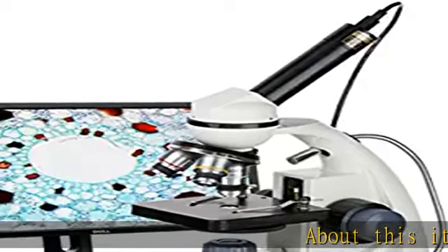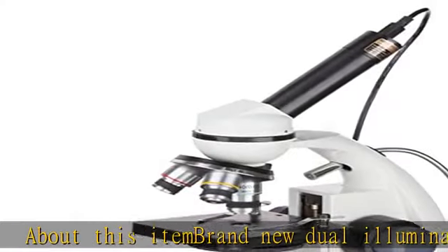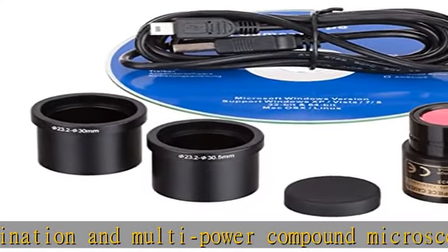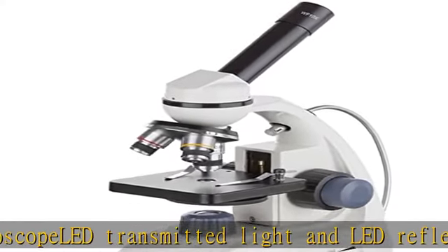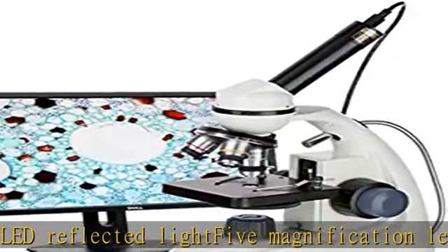About this item: brand new dual illumination and multi-power compound microscope. LED transmitted light and LED reflected light. 5 magnification levels — 40x, 100x, 250x, 400x, and 1000x. Battery power and AC power. Includes 640x480 camera. Check the description to get this product today at the best price.